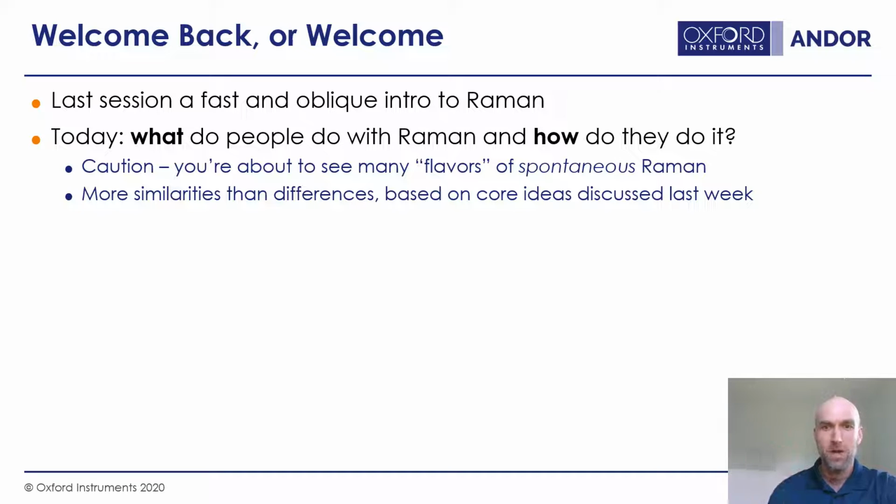That's okay. When I say Raman here, I just want to clarify that it's spontaneous Raman. You're going to see a lot of different variations on a theme, all different applications and different uses and different geometries. But keep in mind there's more similarities than differences based on the core ideas that we discussed last week.